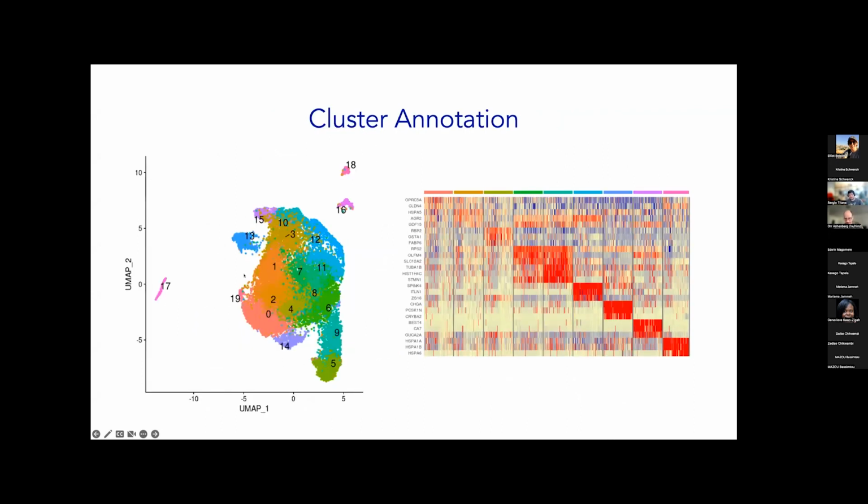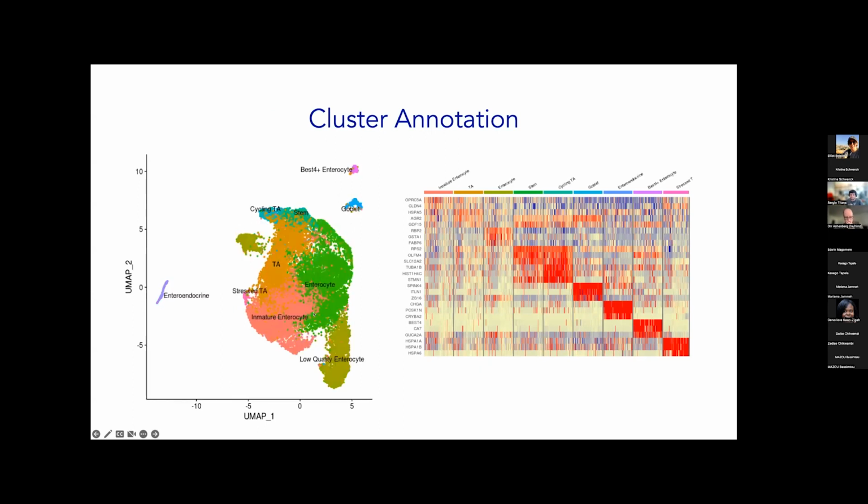And after I have this cluster, I can map this into cell types, and with the differential expression I can say with more confidence what each of them are. And if you do a heat map, you can see the marker genes very nicely here in the diagonal, which is something that Orr presented before.